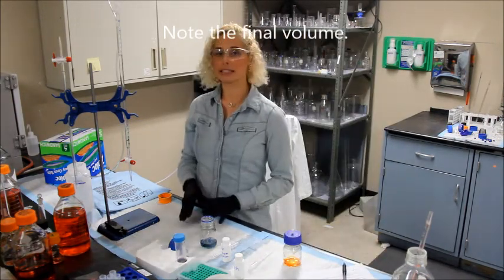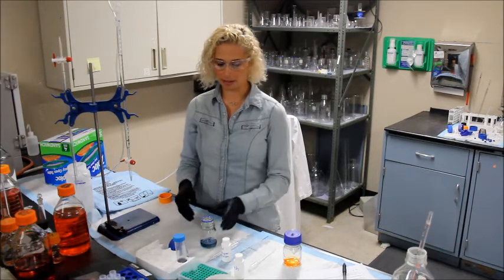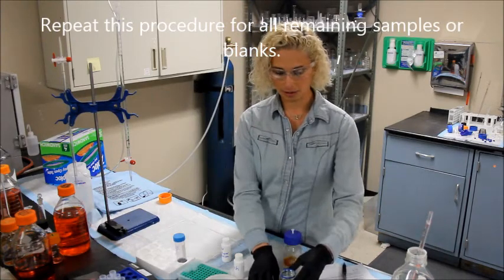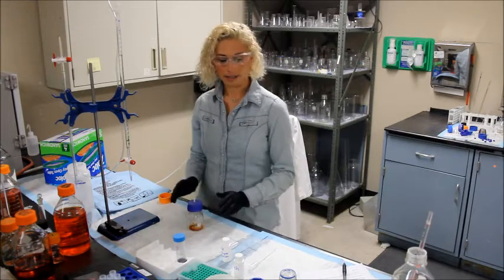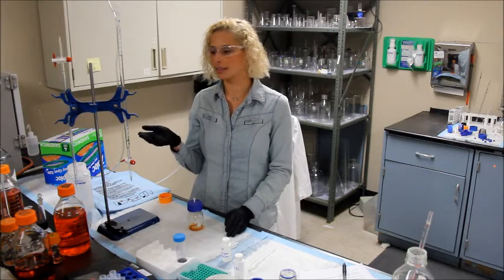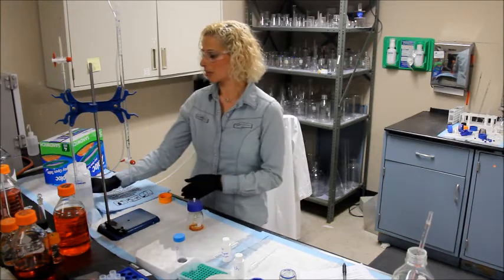You will now repeat this procedure — the same exact one — for your blank vial. You can set the sample vial to the side for the moment. Also, you want to refill your burette, especially if you have a 10 ml burette, so I'm going to go ahead and do that.